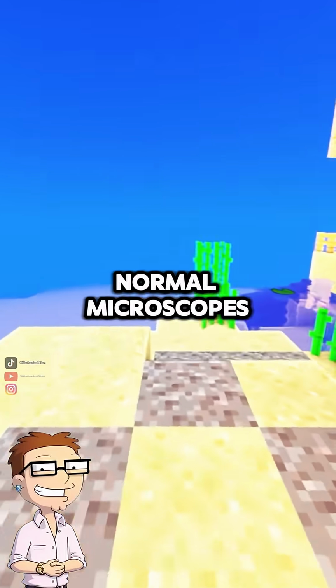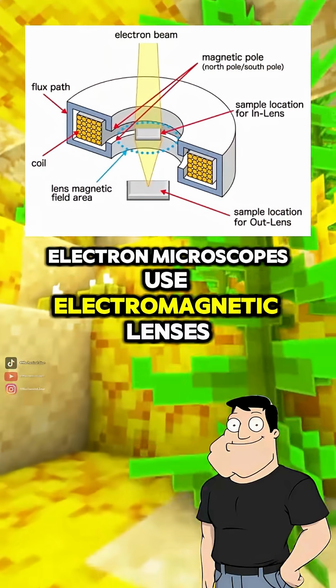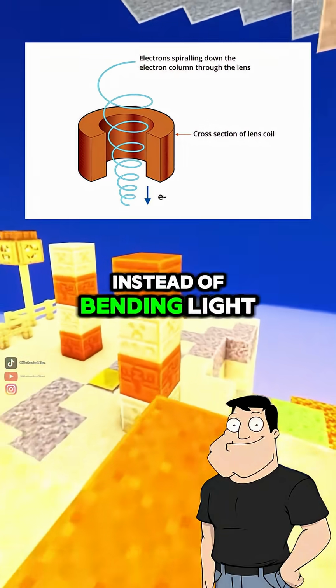No lenses like in normal microscopes? No glass here! Electron microscopes use electromagnetic lenses. Magnetic fields steer and focus the electron beam instead of bending light.